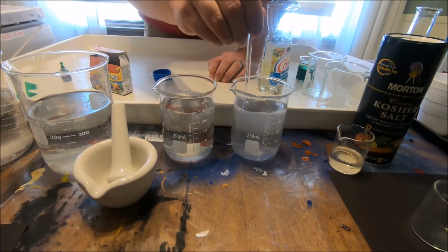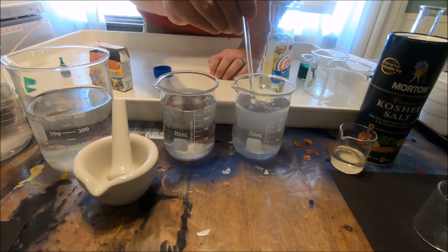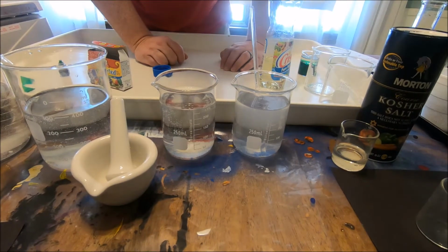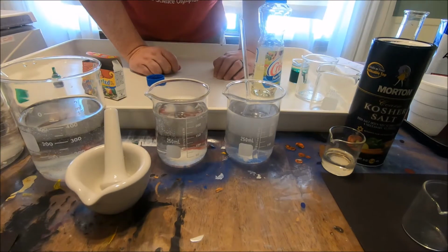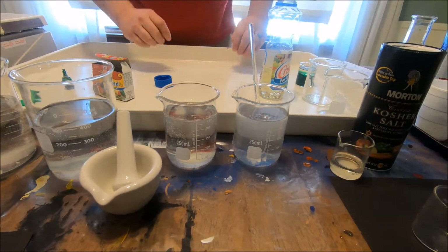As we're working, we'll give it another good little stir just to try to move that along. And we get most of it to dissolve. We'll give it another moment, but we'll just move on so that we don't have to sit here and watch it dissolve. But the faster the agitation, the stirring, the quicker the dissolving is going to occur.